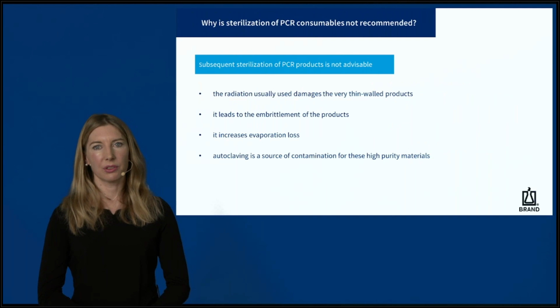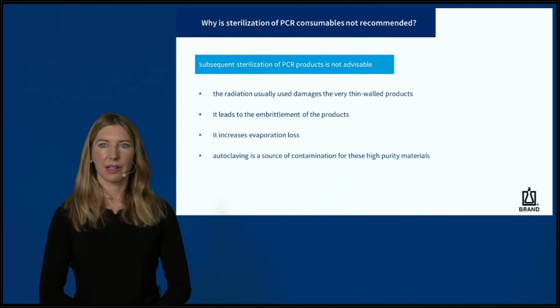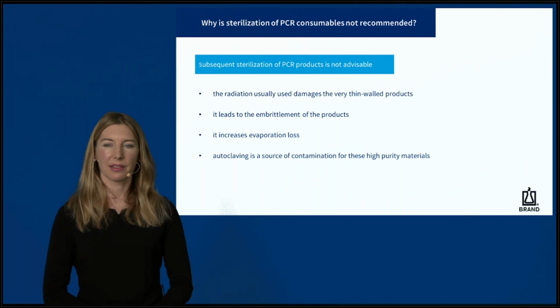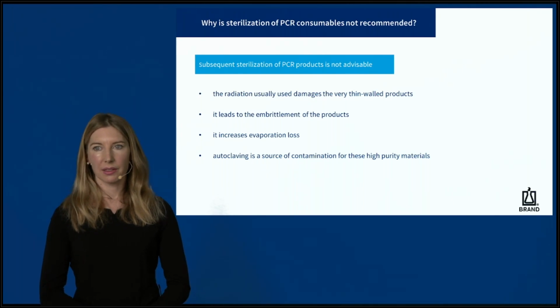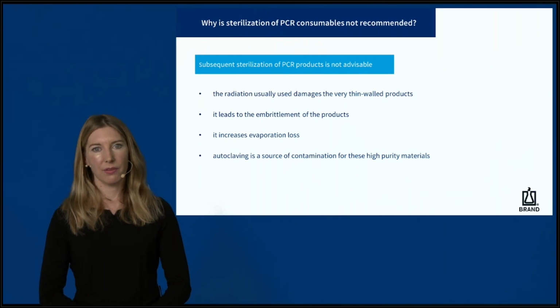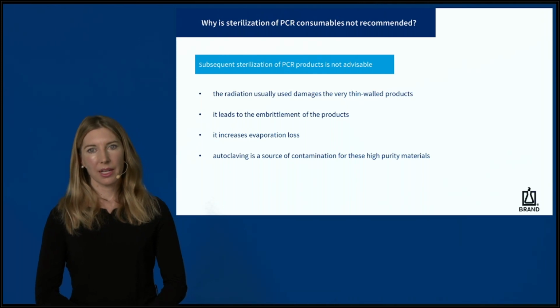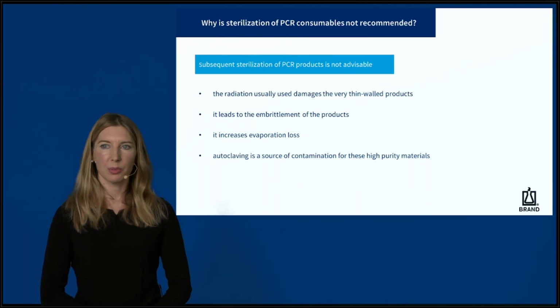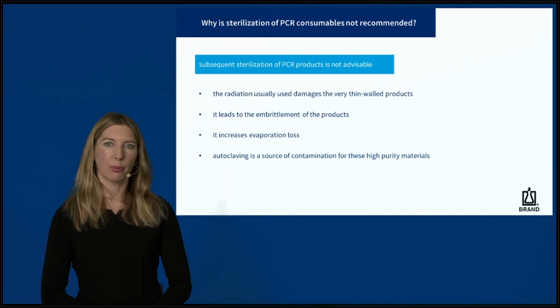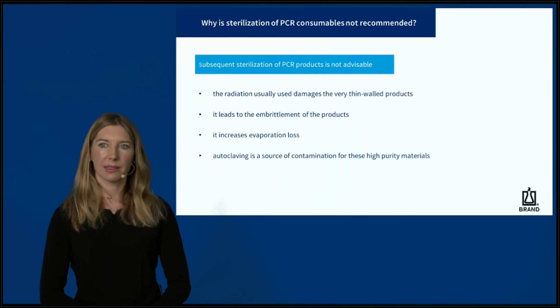The next point I want to address is the question why subsequent sterilization of PCR consumables is not advisable. We do not recommend it because the radiation sterilization usually used damages the very thin-walled products and increases evaporation loss, in addition to the embrittlement of the products. Autoclaving is not recommended because autoclaves are a source of contamination for these high purity materials. During autoclaving, fragmented DNA molecules from microbial debris can be released by the steam and easily contaminate materials and surfaces.